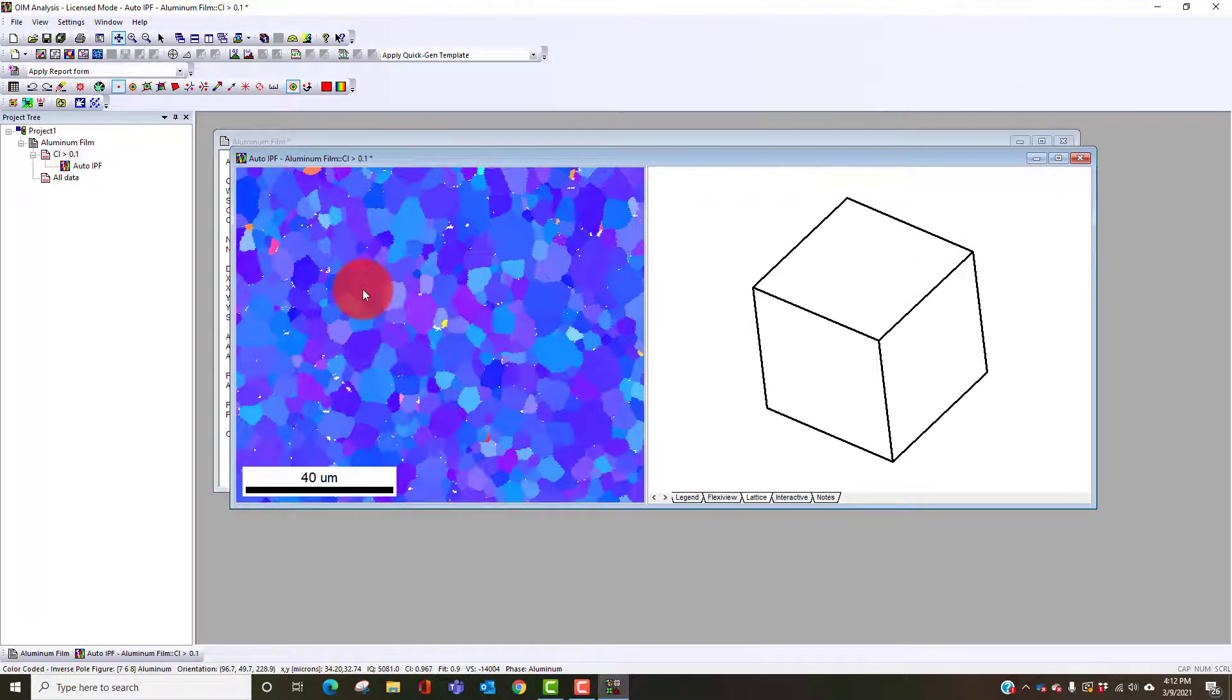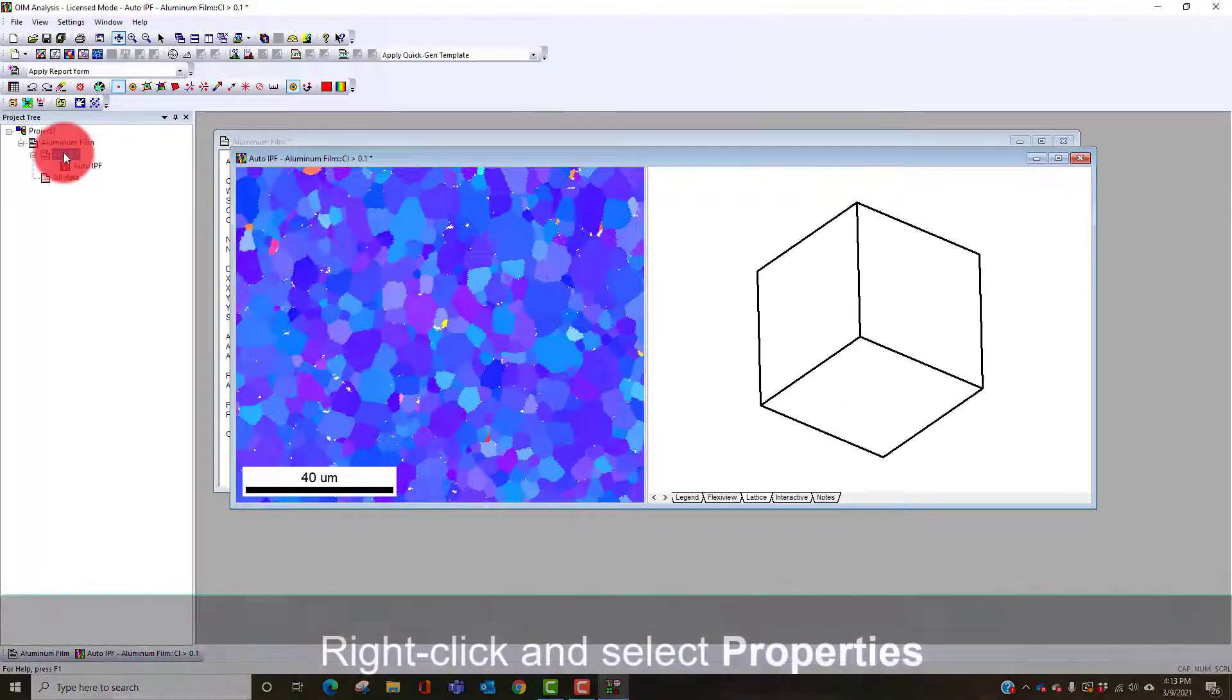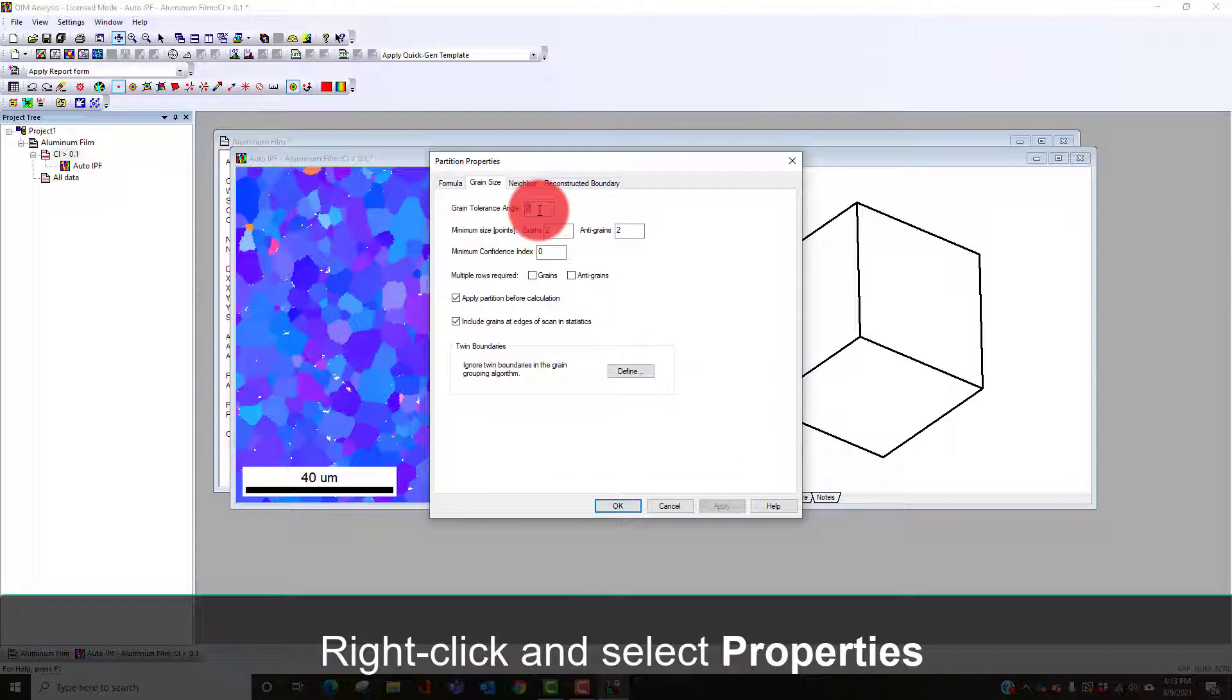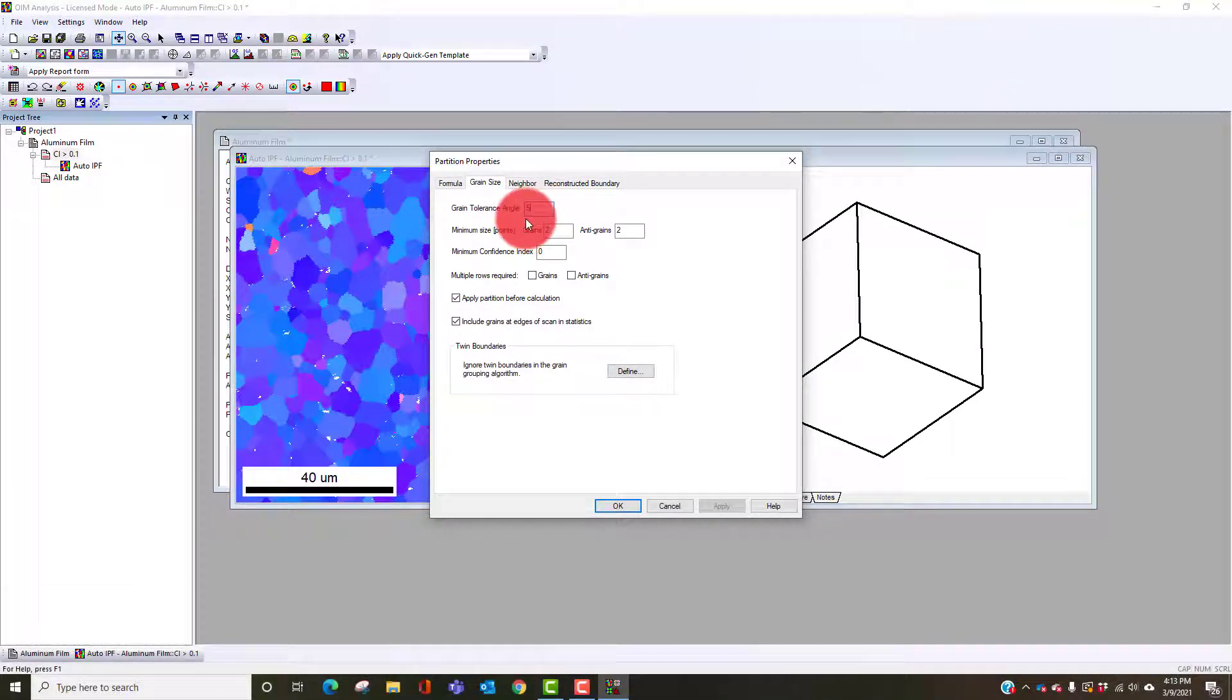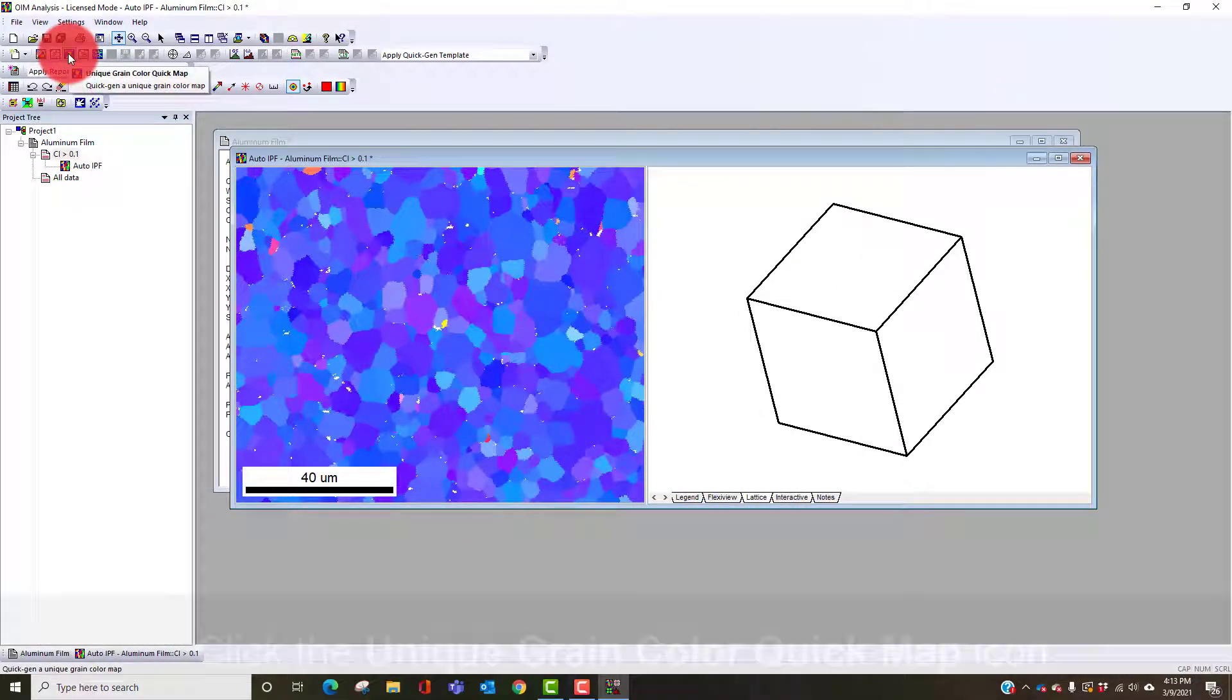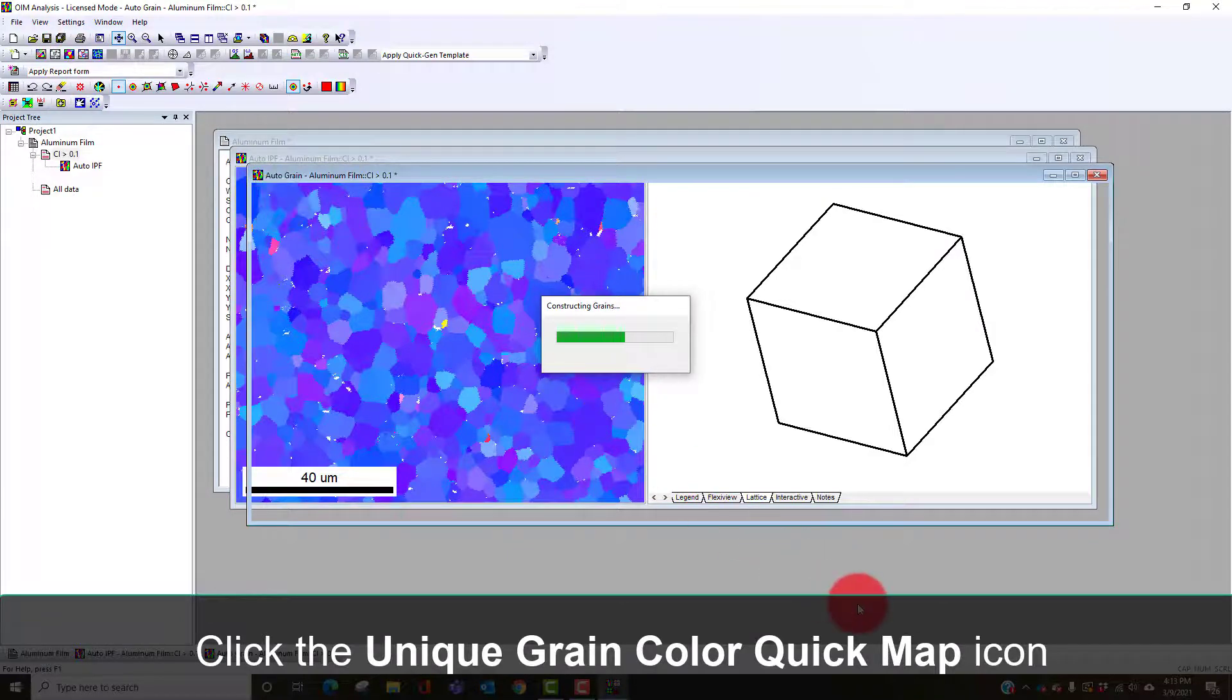If I look under our properties here, our default value is a five degree tolerance angle. Misorientations greater than this are considered part of a grain boundary. We can see the grains defined by that misorientation angle by hitting this for our unique grain color map. It'll calculate the grains based on that definition.